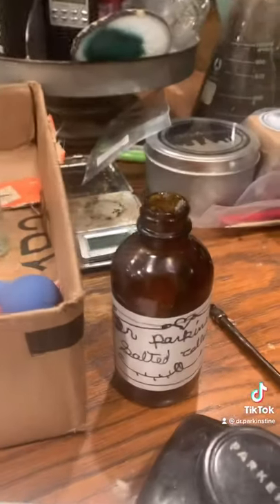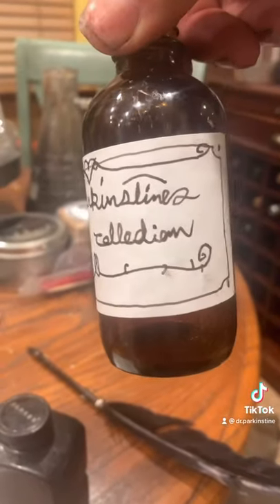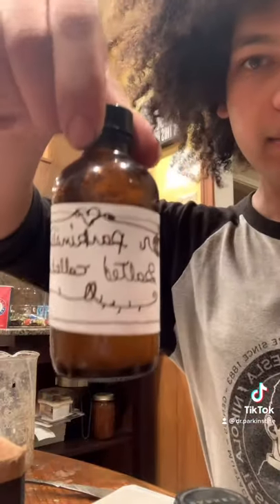Now I will pour the collodion into this bottle that I labeled. Now I will thoroughly mix the contents of this bottle by shaking it. And here is the finished product. Thank you.